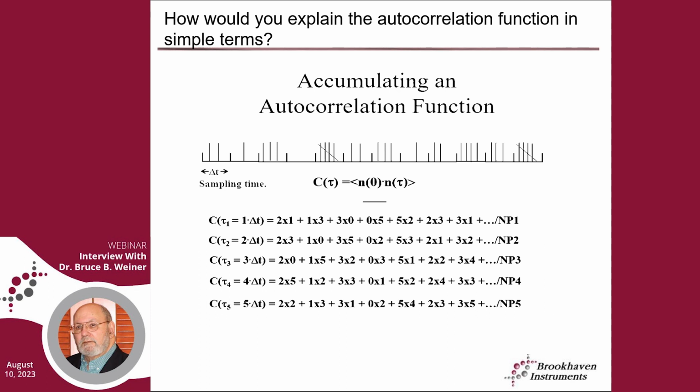Anyway, this is... Do you get more data with a smaller time interval, like nano? No. Those time intervals depend on the ultimate... I'm just thinking how many... correlation. If you have very small particles, then the correlation function will end very quickly, and you better choose that sampling time smaller, like 1 microsecond. If you have very large particles, they diffuse more slowly, and the correlation function is going to go out for a very much longer time, and so you pick that sampling time to be much bigger, 10, 20, 50 microseconds.